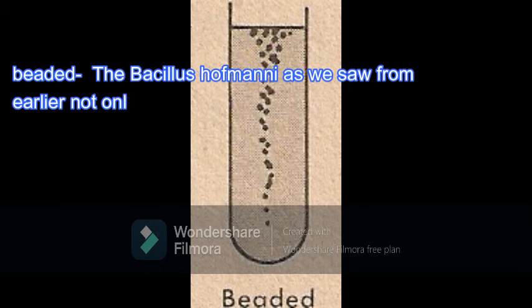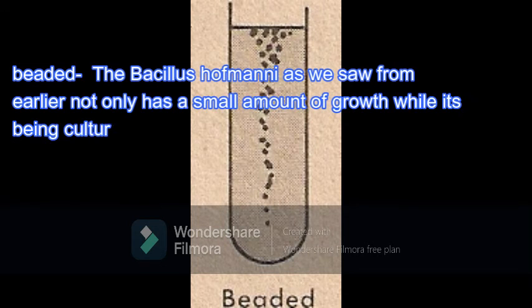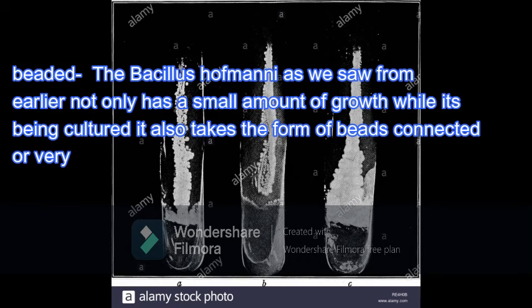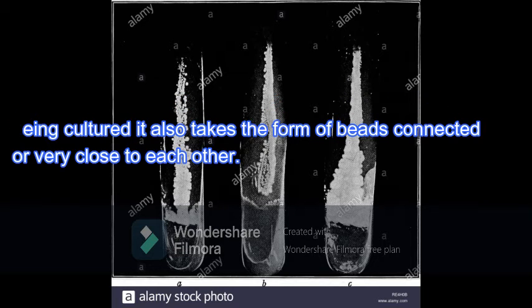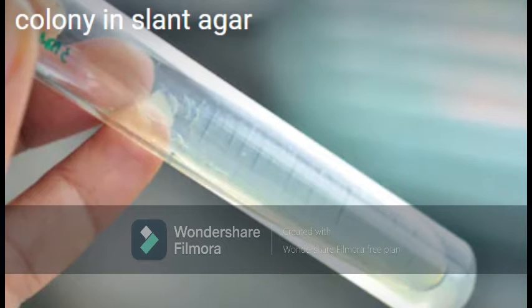The next form is a beaded form. It's called beaded due to it looking like beads attached to each other or in very close proximity. An example of this is the Bacillus hoffmanni, as we saw earlier. Not only has a small amount of growth while it's being cultured, it also takes the form of beads connected or very close to each other. Another example of a beaded form is the Streptococcus lactis.